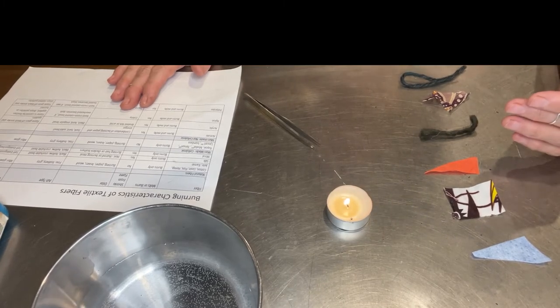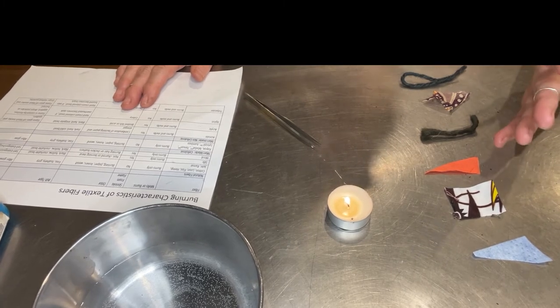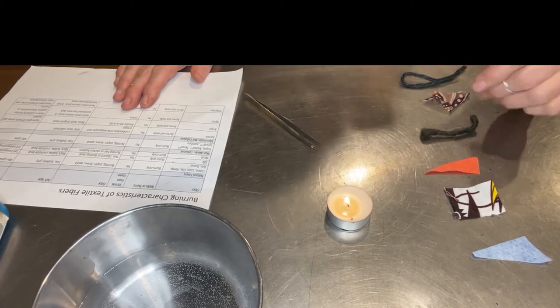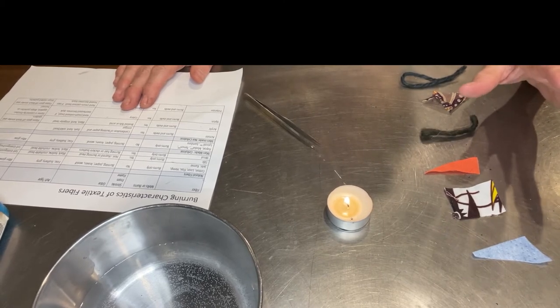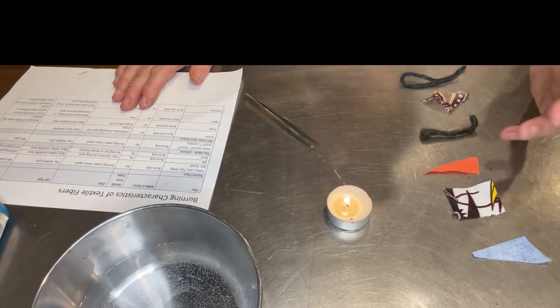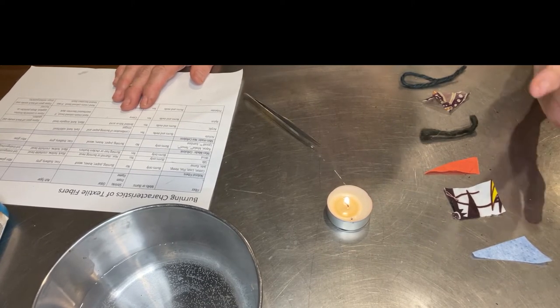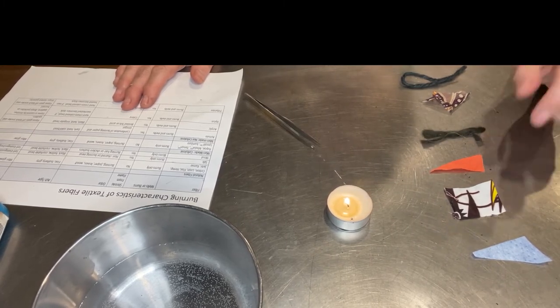When you smell it, be careful — it's obviously hot and you don't want to get it too near your face. If it smells like paper, then it's cellulosic. It could still be man-made — it could be rayon, Tencel, or modal, which are cellulosic fibers from trees but are put in a chemical solution and forced through a spinneret, so they're considered man-made. Same with bamboo — even though we think of it as natural, it's man-made because they put it in a solution. It could also be cotton, jute, linen, or hemp — they'll all act the same way and smell like paper.